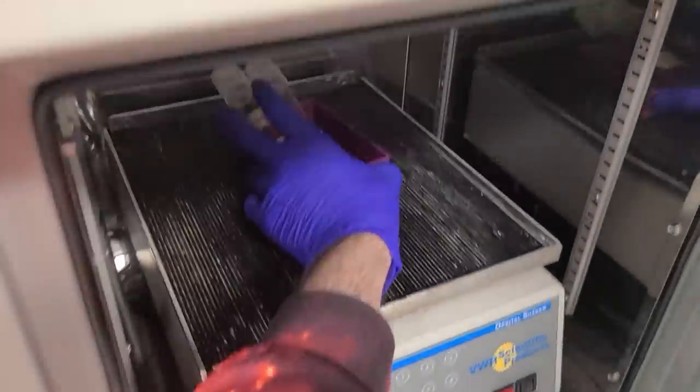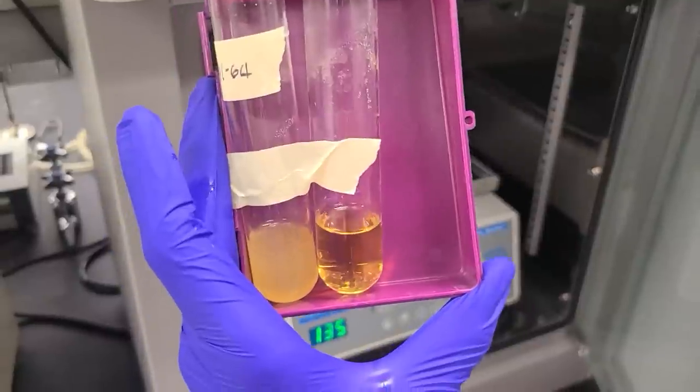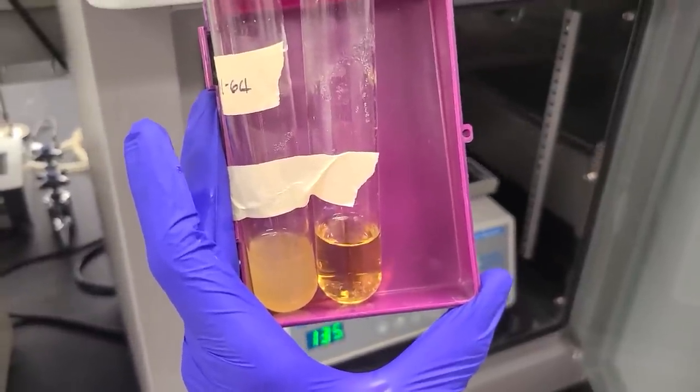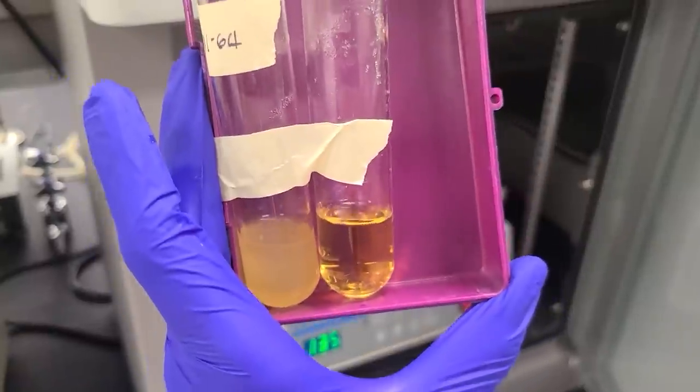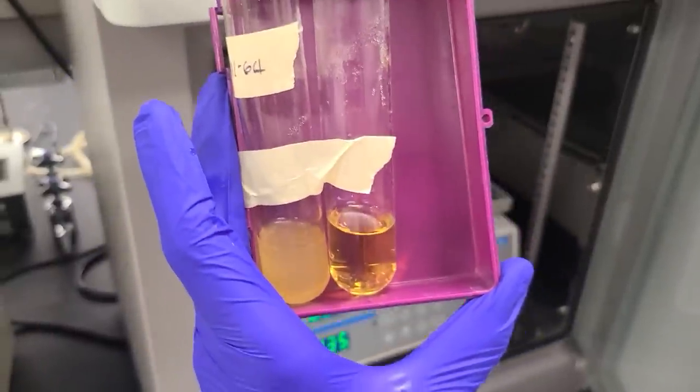All right, let's see what we got. Yeah, there we go. See how the one on the left that we put bacteria in is now full of bacteria, and the other one isn't.